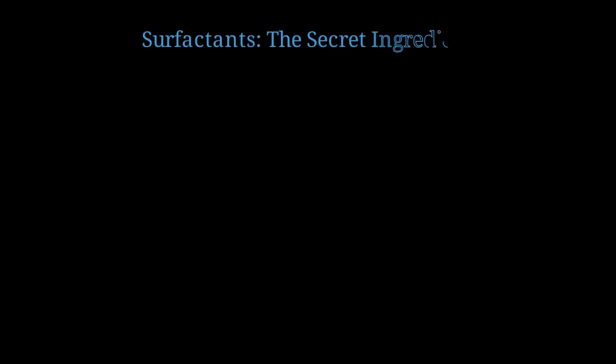Now let me tell you about surfactants. These molecules are absolutely critical for stable droplet microfluidics.